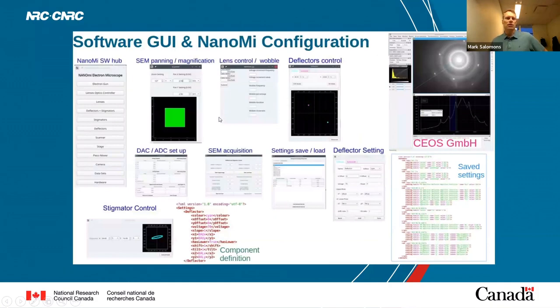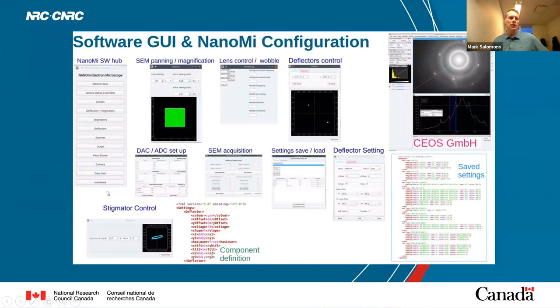Here's an example of the software system — we have a hub and then various modules. If you're doing SEM you have SEM panning, mag, and acquisition. If you're doing TEM, of course we have our stigmator and deflectors and then the actual imaging. It's very modular and can be added to at will for any kind of module you want to add.